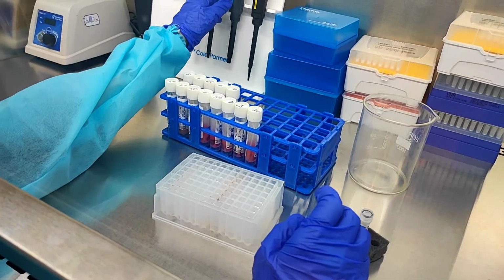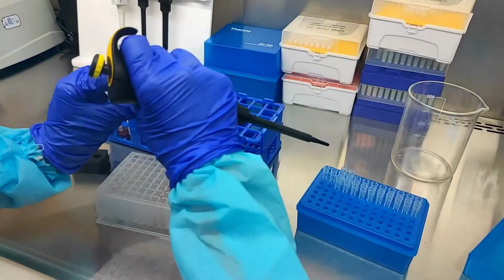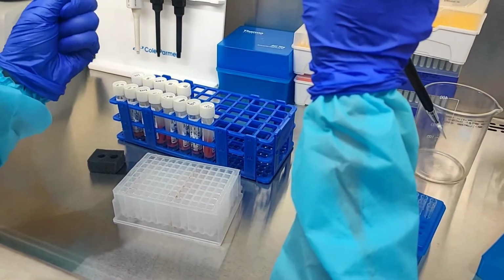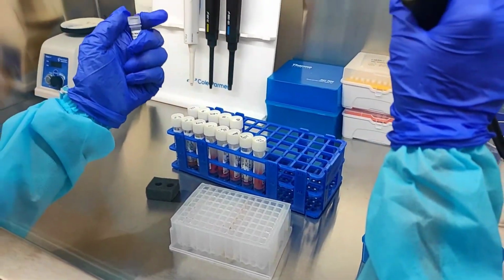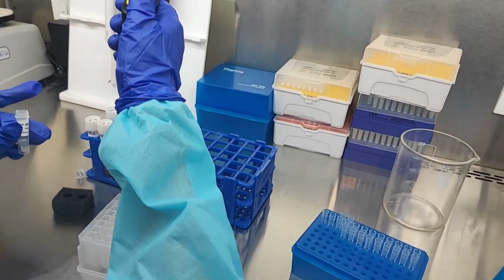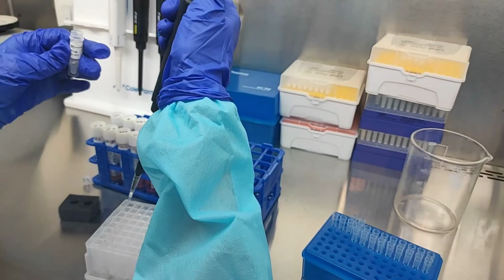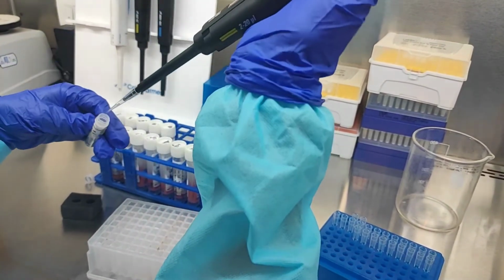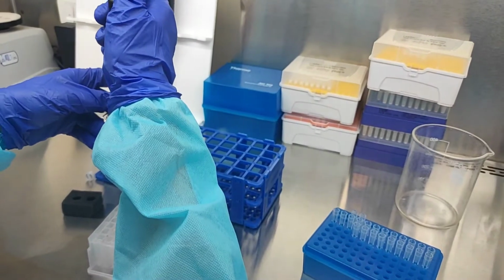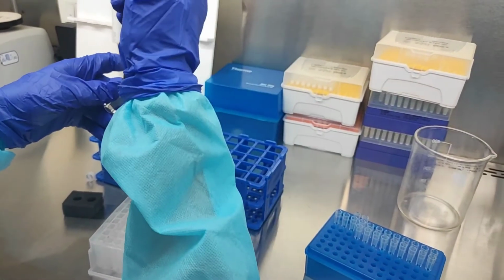Removing the aluminium foil from the plate. Dispensing 6 microliters of carrier RNA in the first well of the plate. The carrier RNA was in lyophilized form. I already resuspended it with TE water.